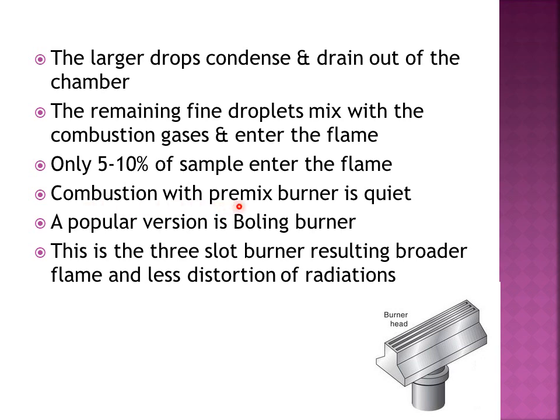Combustion with the premix burner is quiet. It is very quiet. This is the advantage of this burner, because the previous one, the total consumption burner, is very noisy. A popular version of this premix chamber burner is the Boling burner, which is shown here. This is a 3-slot burner.